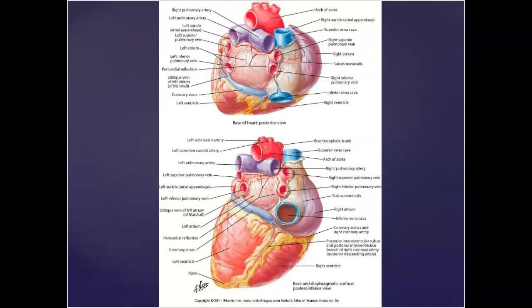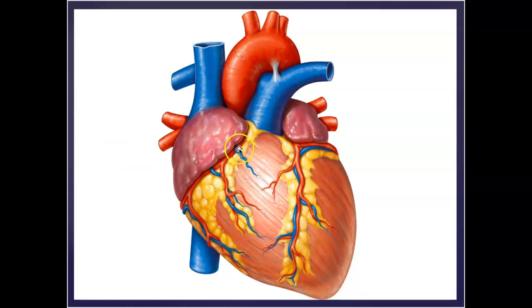So let's look back at these coronary arteries for a bit and see the right coronary artery coming off just distal to that aortic semilunar valve. In the aorta, the first branches here are going to be this right coronary artery. Now, to dissect into this, you'll need to take a blunt probe and dissect some of the fatty tissue around this. You might be shocked at how much fat is around the heart. It's actually quite shocking sometimes. So depending on the hearts that you have, you might need to do quite a little dissection around this coronary sulcus through here.